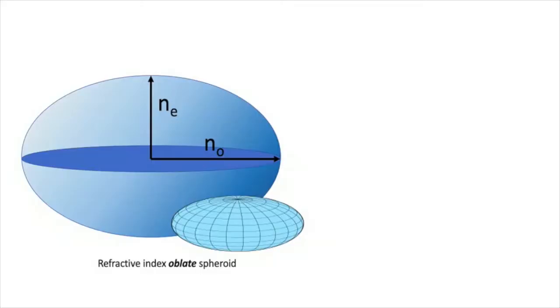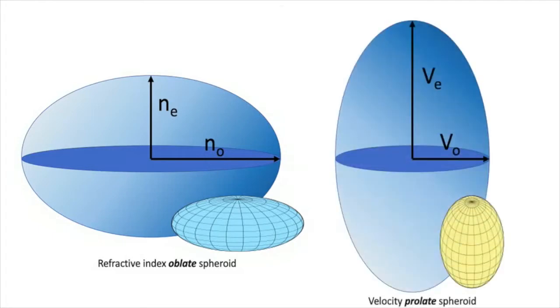We mentioned several times that calcite is a uniaxial negative mineral. We said why, but we haven't demonstrated it. We'll explain now how that can be done.